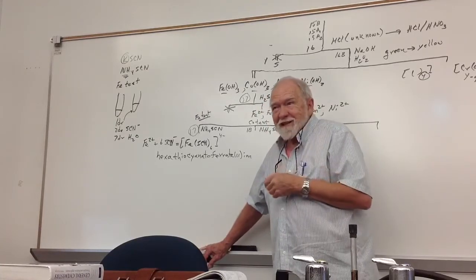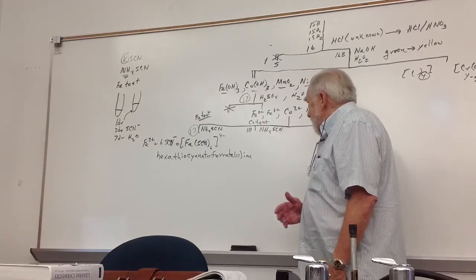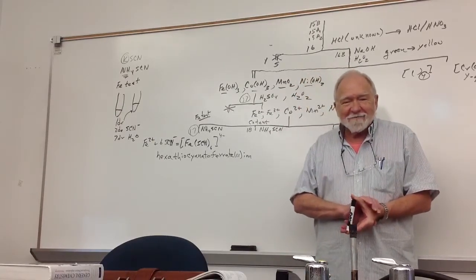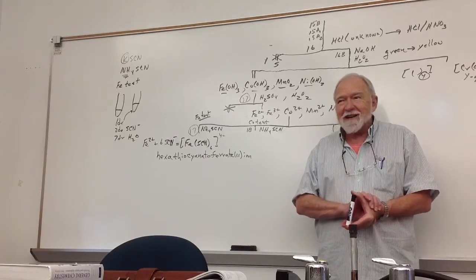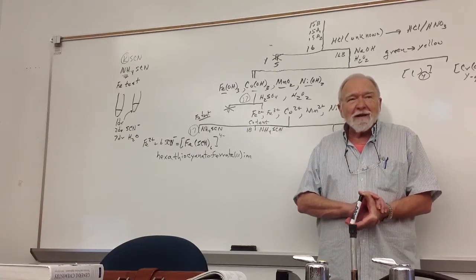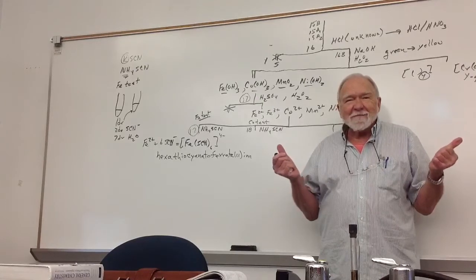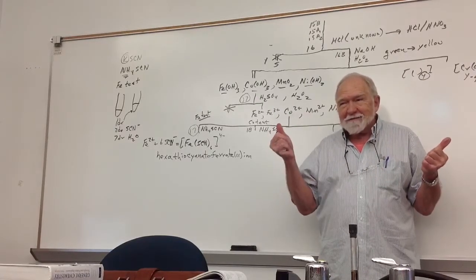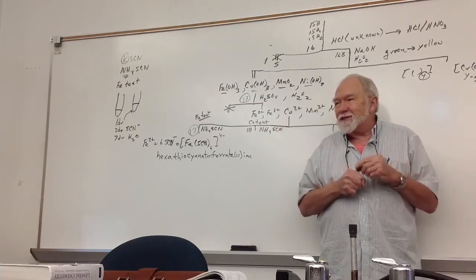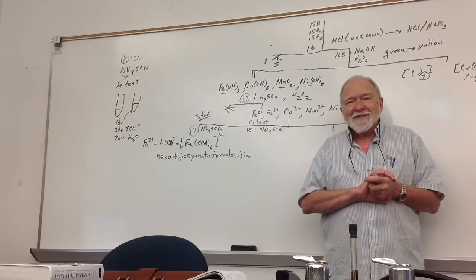Oh, statistics say, I'm not going to gamble if it's that light. You can, if you want, say, well, maybe I had a trace and I lost something. Especially, well, if you went through all the procedures and didn't find anything else, then you could say, I might have had iron in there, or I really messed up and I should get a new sample. People always ask me, how many ions do you put in there? And the answer is, think about the statistics. I said, I'm not going to give you any distilled water samples. I don't do that anymore. I used to get a lot of answers for distilled water with 3 or 4 different ions in there. Okay? So I don't do distilled water anymore.